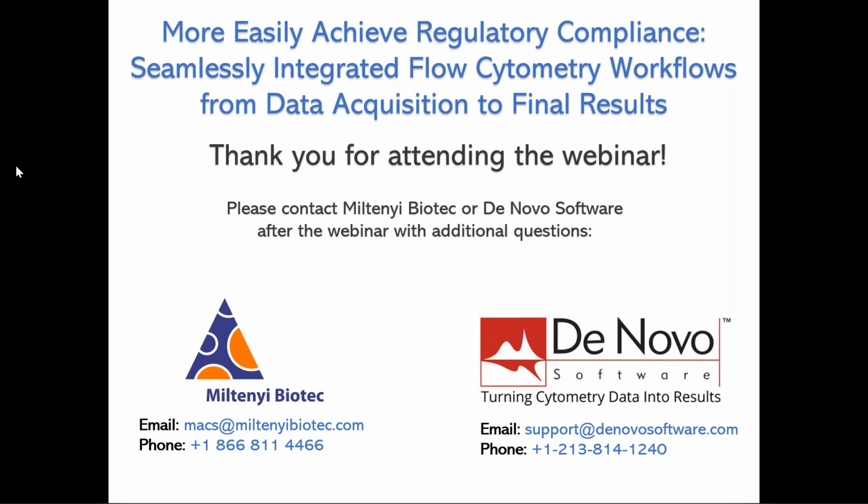Excellent. And here's a question I was thinking of, Caleph, maybe to spur some discussion here as well. I noticed with the MACSQuant Tyto systems, you have this concept of recipient and donor instruments. Say you have a donor instrument located in some central location, and then another lab is working on a recipient instrument, and they define some setting that seems to be improved upon.